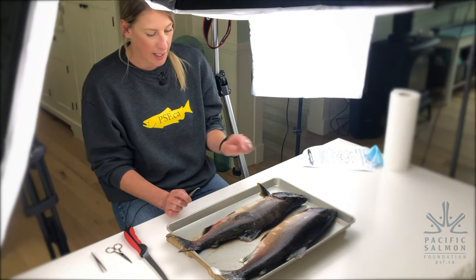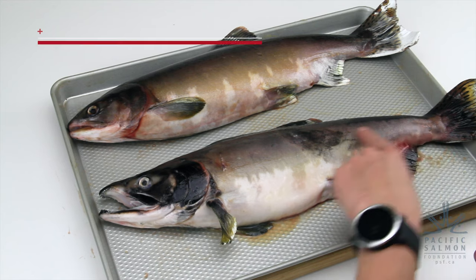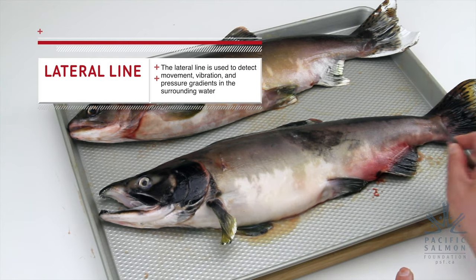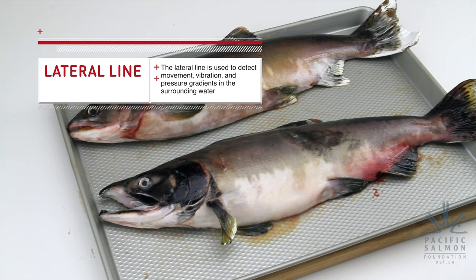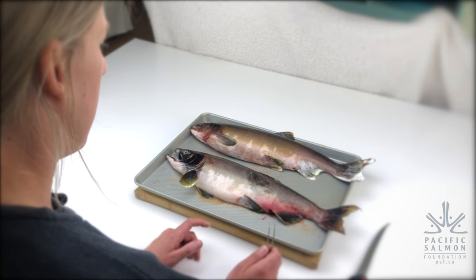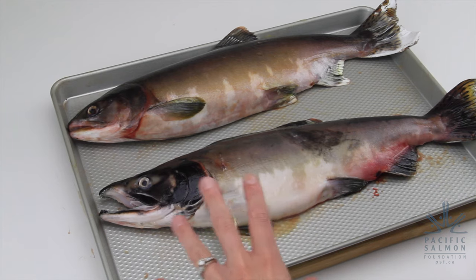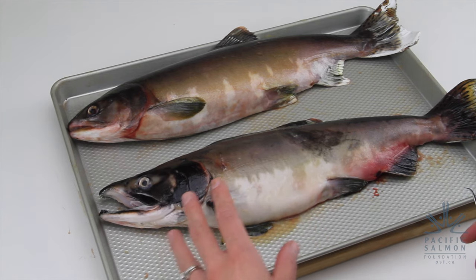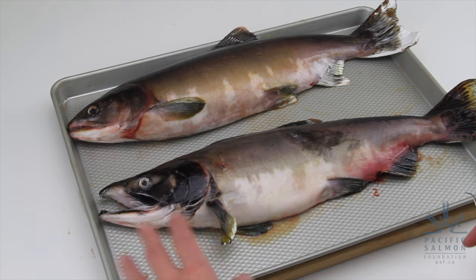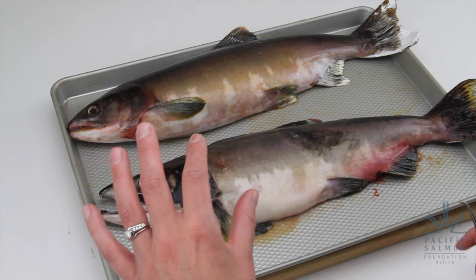The next thing we'll look at is something along the mid-center of the fish's body, called the lateral line. It's a little bit difficult to see on these fish because they're in their spawning colors, but it runs along the mid-length of their body. It acts as a sensory organ — it allows the fish to detect vibrations and movement in the water, so it can detect nearby predators or prey, and it helps fish in a school avoid bumping into each other.